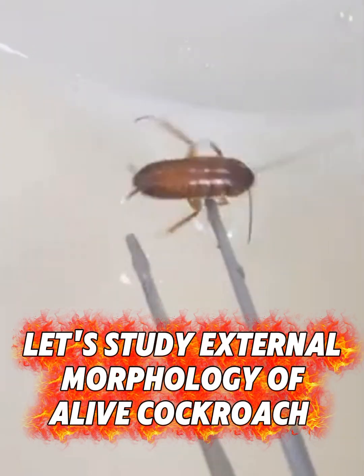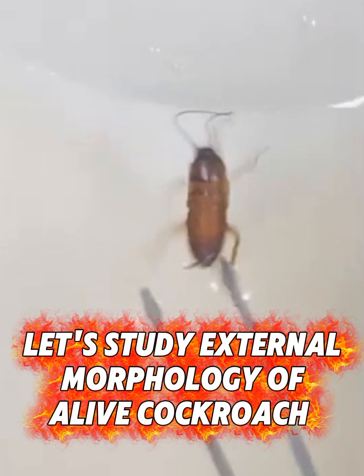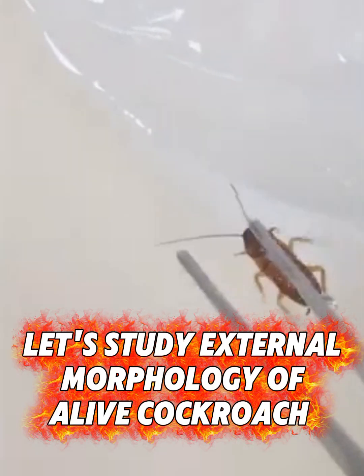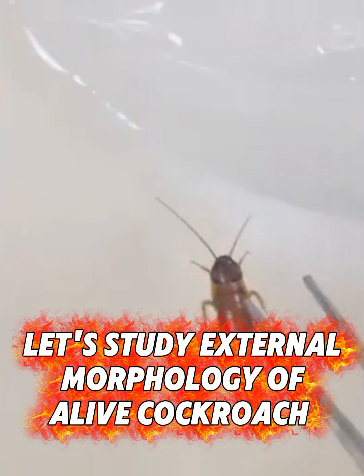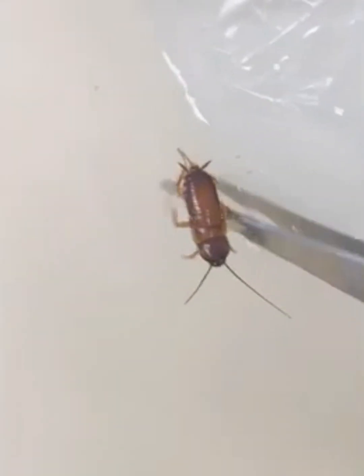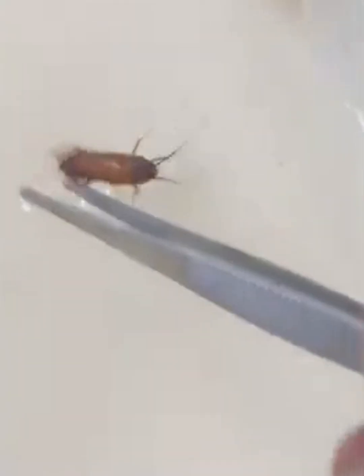In today's video, we are going to perform a complete cockroach dissection and study its internal anatomy. Before beginning the dissection, let's first observe the external features of a live cockroach. The cockroach you are seeing here is alive and moving naturally. Observing a live specimen will help you to understand the body structure and identify its external parts. So before beginning the practical, let's discuss the cockroach.